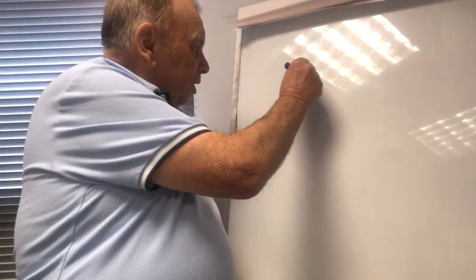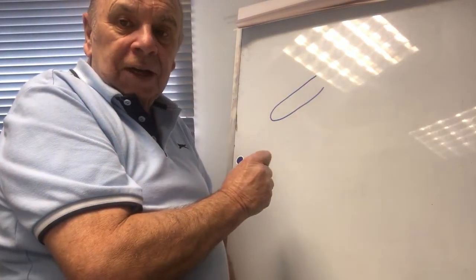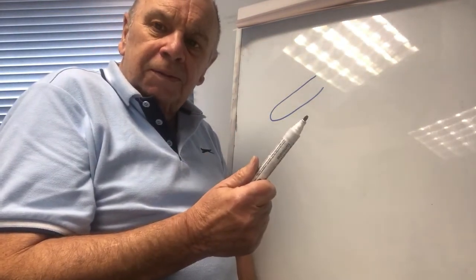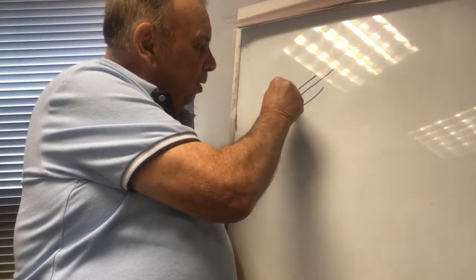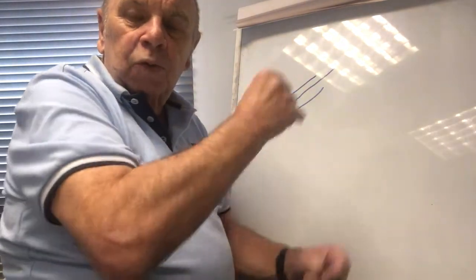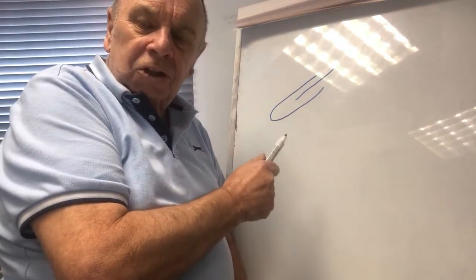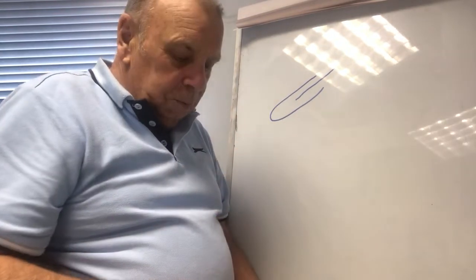Let's look at a test now for oxygen. That contains oxygen gas. This time I take a glowing splint and I stick it in there. There's the glowing splint. It's not a light, it rekindles it. So a test for oxygen is it relights a glowing splint.